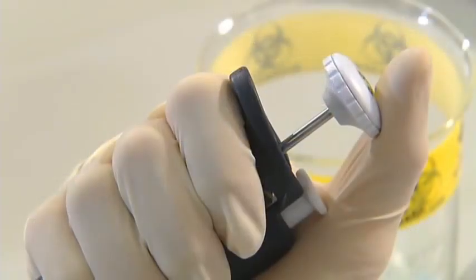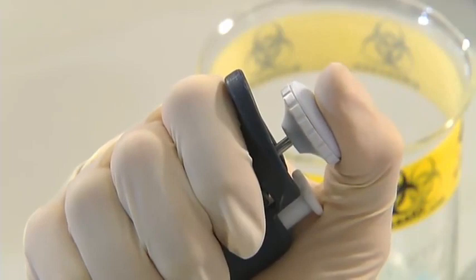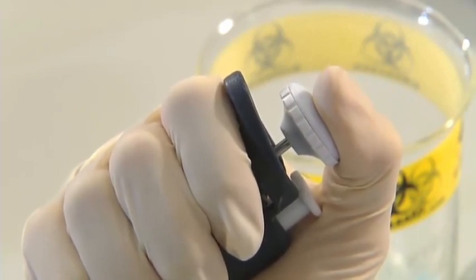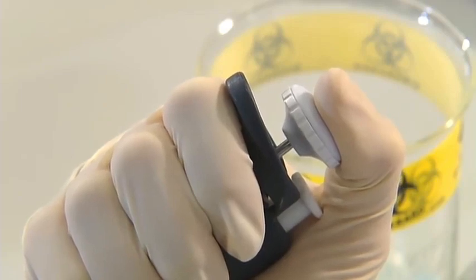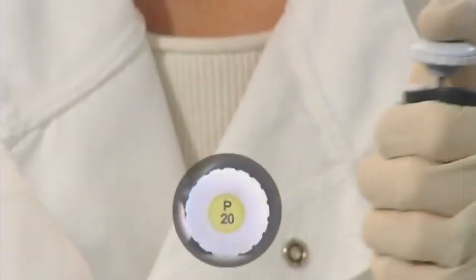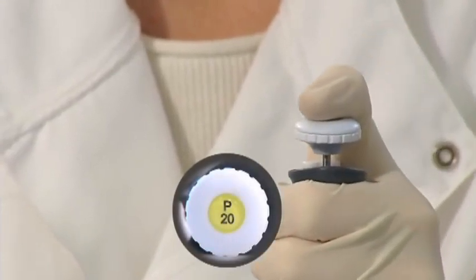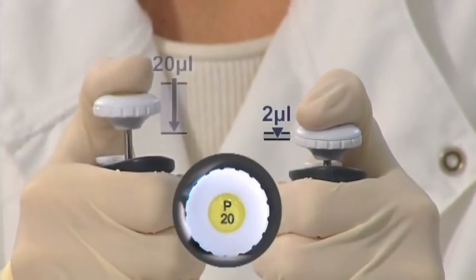Liquid is drawn in and expelled using the pipette's push button. Gently apply pressure to the button with your thumb until you feel a natural stop. This is called the first stop. The distance you need to push the push button down will vary depending on the volume you require. A P20 set to 2 microliters will require less push-button movement than a P20 set to 20 microliters.